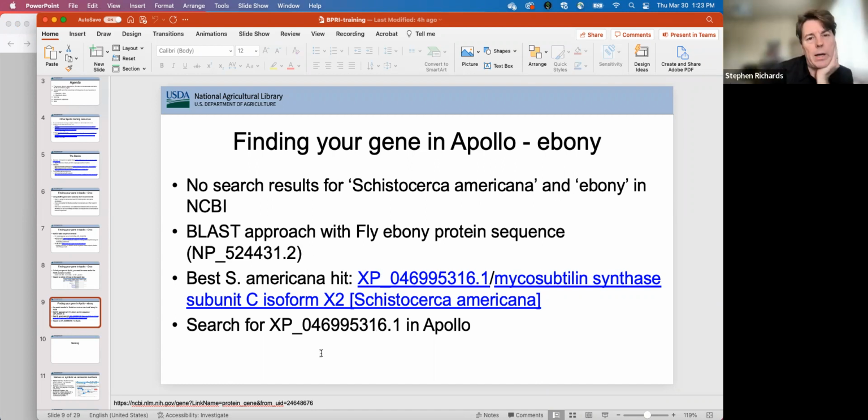So we can ask you that. I mean, this is fairly basal when it comes to flying insects. So the nearest things would be a cockroach or a termite. Is that right, Ho-Jun? Yes. I don't think we've got a good annotation of either of those. I don't know about termites. And then if I go completely basal to flying insects, probably the next big thing that comes to mind is Daphnia. And I'm kind of thinking that maybe it's best to just stick to Drosophila. Do you know of anything else that's well annotated?